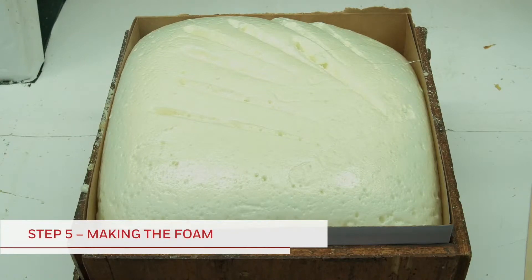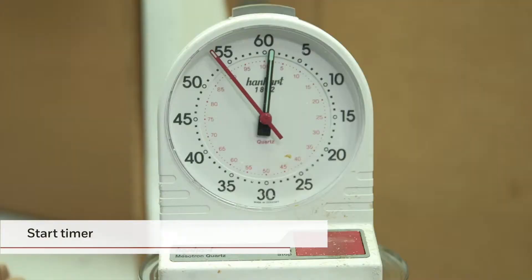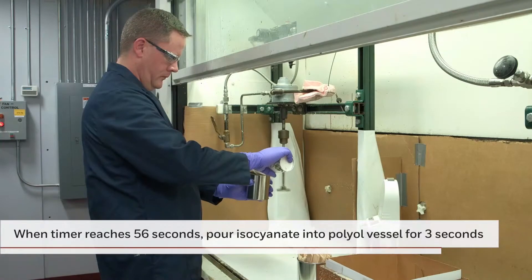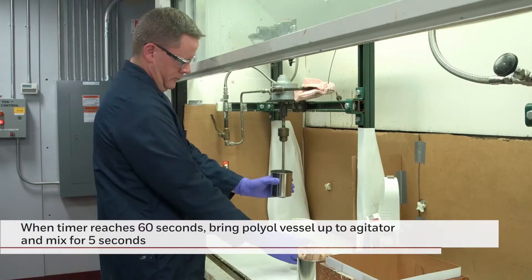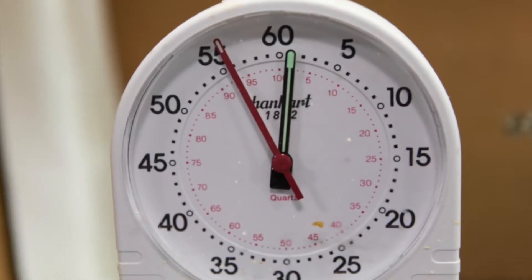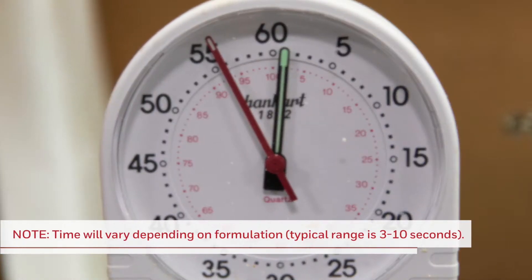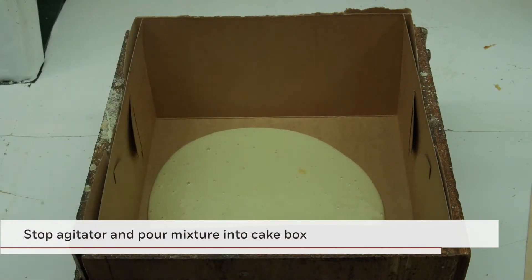Next, we will demonstrate the foam making process. First, start the agitator. When you are ready, start the timer. When it reaches 56, pour the isocyanate into the polyol vessel for 3 seconds. When the timer reaches 60, bring the polyol vessel up to the agitator and mix for 5 seconds. The isocyanate-polyol combination is agitated for the length of time required to ensure a thorough mix. This time will depend on the reaction speed of the formulation and can typically range from 3 to 10 seconds. After 5 seconds, stop the agitator and pour the mixture into the cake box container.